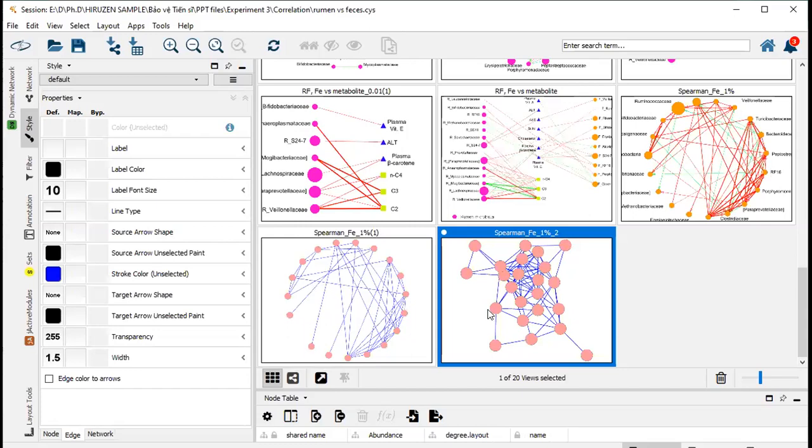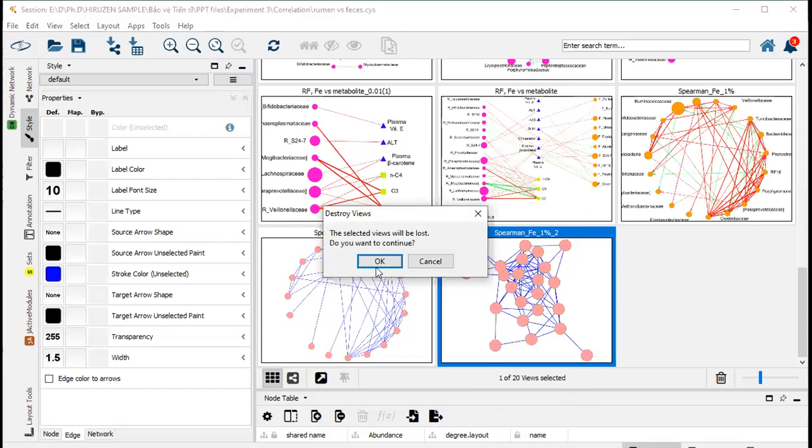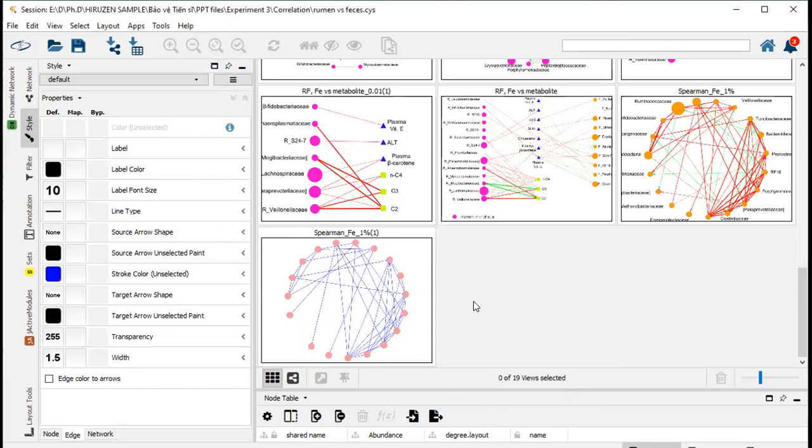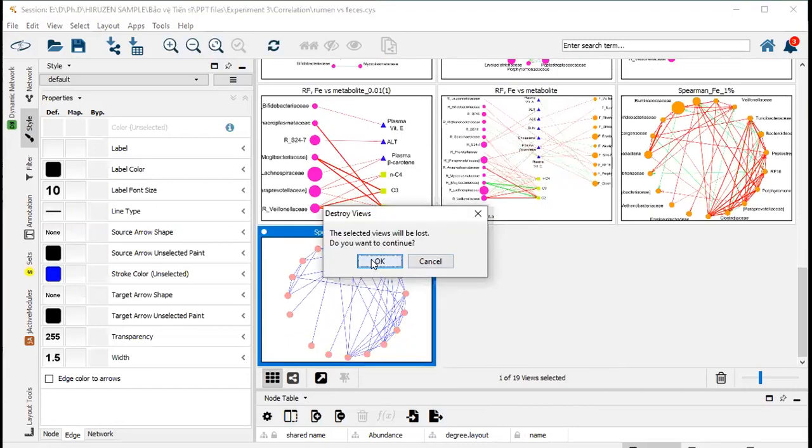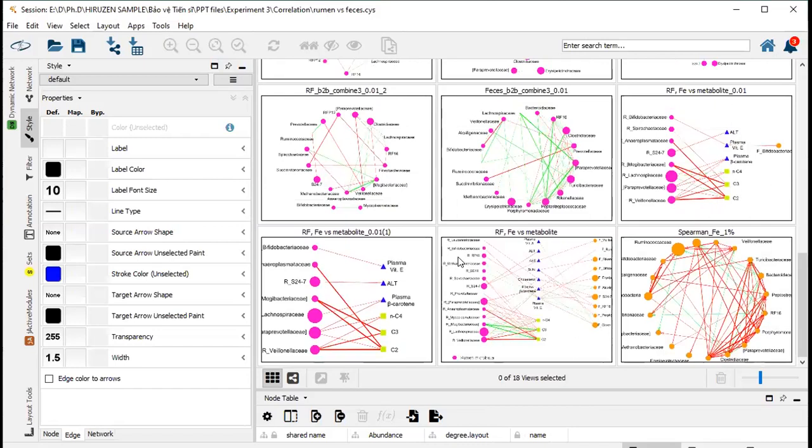That is the setting for the first section. Any other question for this? Okay, if no, I will move to the next step. The next section is about the interaction between bacteria and, like, blood metabolite or milk component, or in Azimuth-san's case, fermentation products.